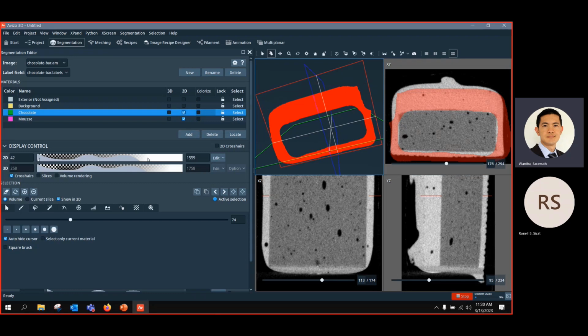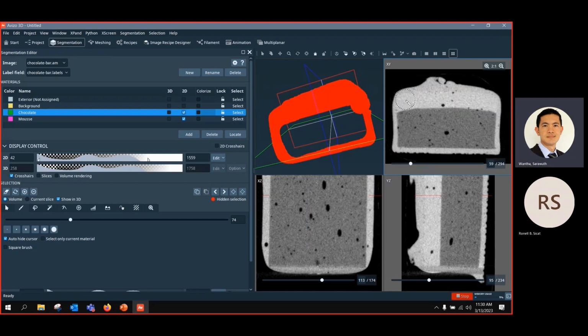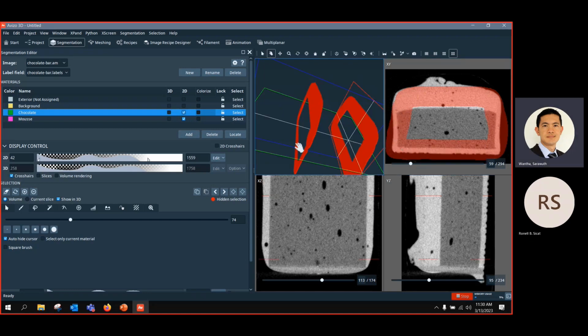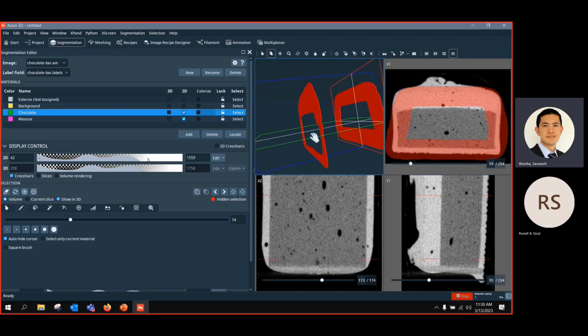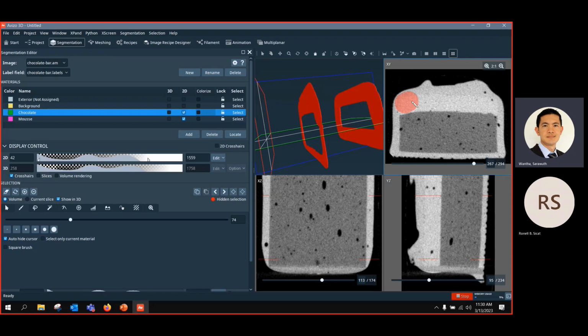You just draw a contour line and then select these voxels in 2D. And because I draw in one slice, it's always 2D. If I go back here and draw one more time, I also get another 2D. But we have another tool that is really useful in terms of how you can create it, which is 3D interpolation of the shape that you created.